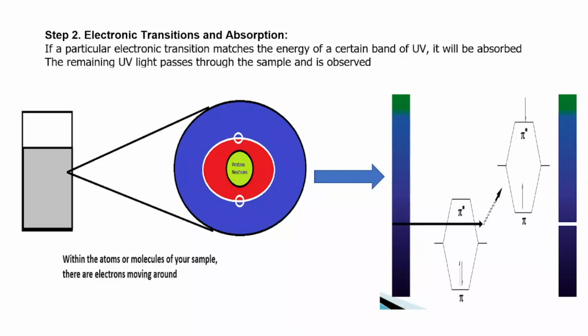As I said earlier, follow the cursor very well. You see that where the cursor is pointing to was the particular section of the whole UV radiation that the electron absorbed, right? Now you can see that that same section, when I match it, is colored white over here. It means that this section was absorbed, right?